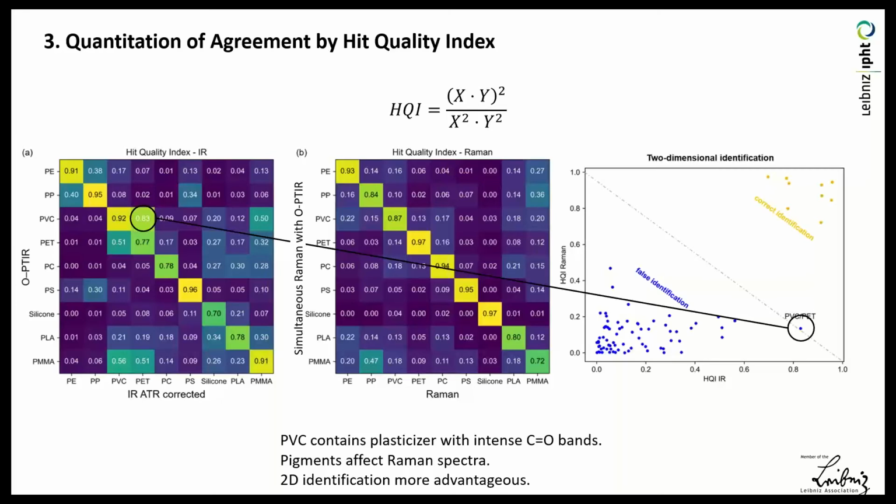For example, if you have pigmented plastic or particles, they can give a high autofluorescence background, or you get resonance enhanced contributions from the pigment. For example, very famous, the blue pigment, the phthalocyanine, they are used as a very popular dye.